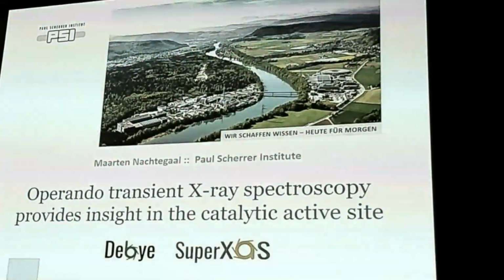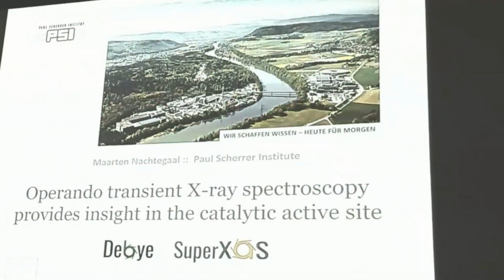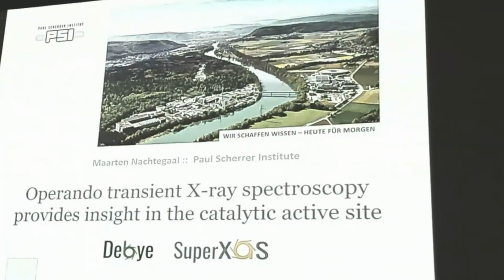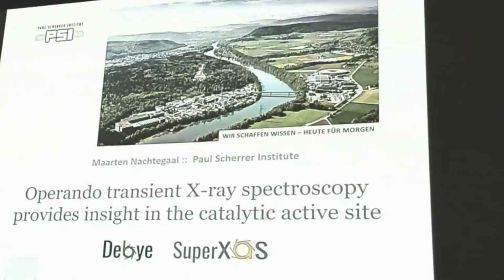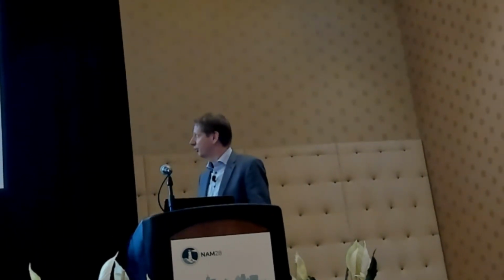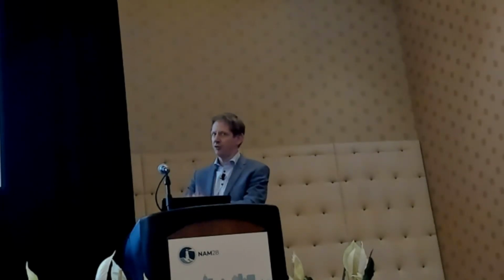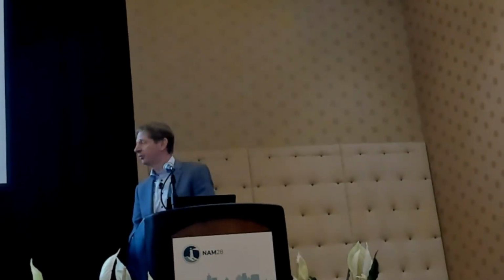Our group operates one beamline, the SuperXAS beamline, at the synchrotron, and will start commissioning a second beamline that combines X-ray absorption spectroscopy, X-ray diffraction, and total scattering. So the title of my talk is really not just putting buzzwords together. We really need this: doing operando, transient X-ray absorption spectroscopy to really get inside catalysis.